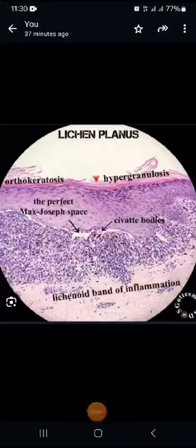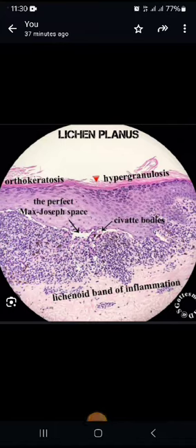Assalamu alaikum everyone, I am Dr. Roba. The task assigned to me today is the histopathology of Lichen Planus. I'm going to discuss this picture at low power showing the changes present in LP, and then discuss these changes in zoom view one by one.